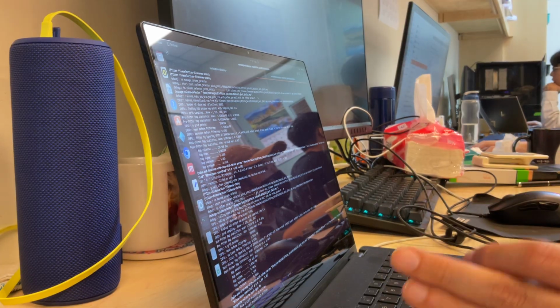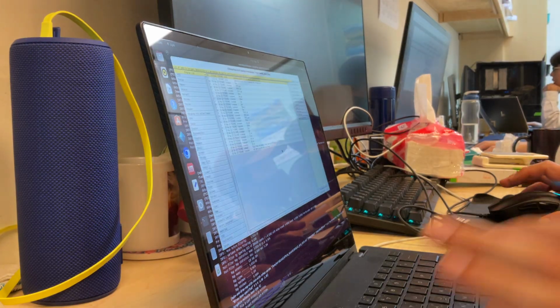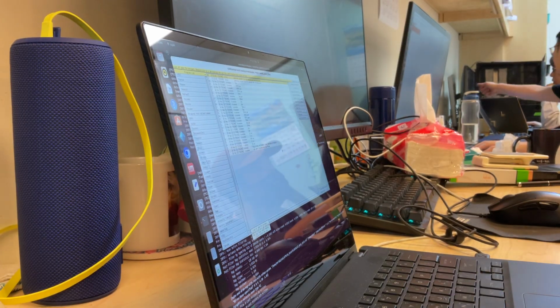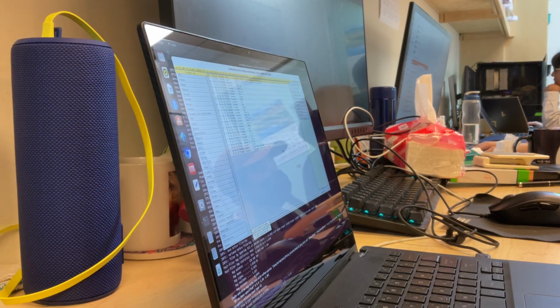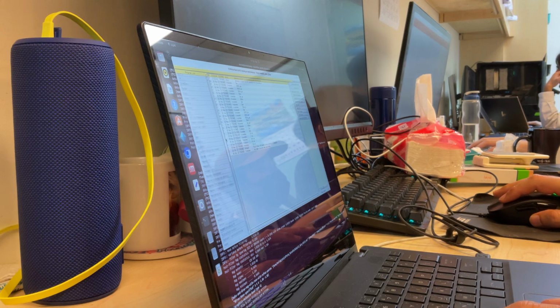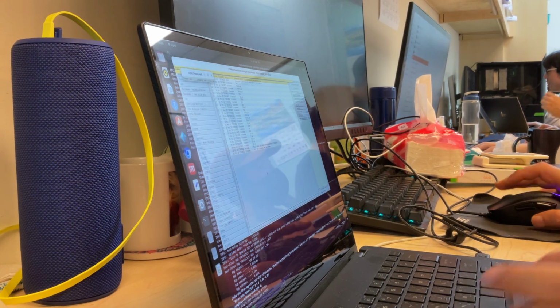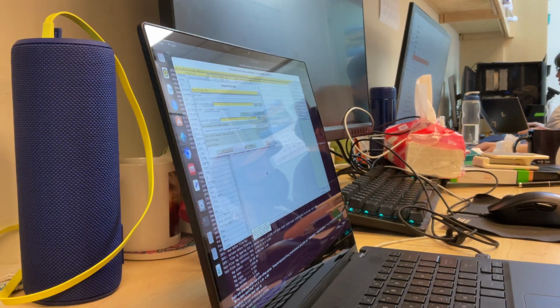So the next thing we're gonna do is, now that we have this, we can generate our own pair of densities. To do so, which one are we interested in? 180. Let's go for 180. So now the first thing we need to do is run CAD. CAD is a program to combine different MTZ files into a single MTZ file.